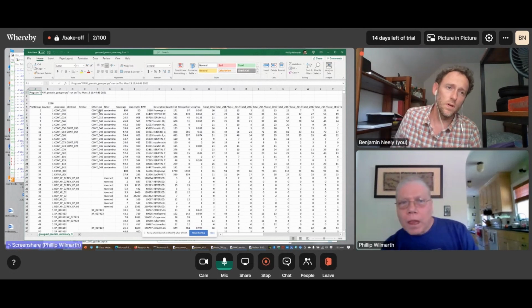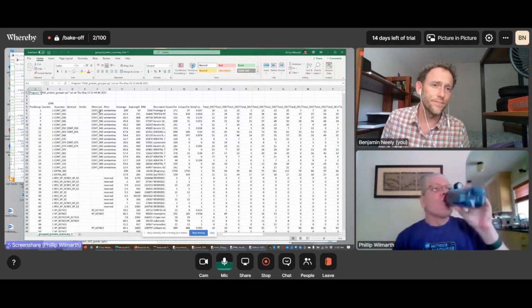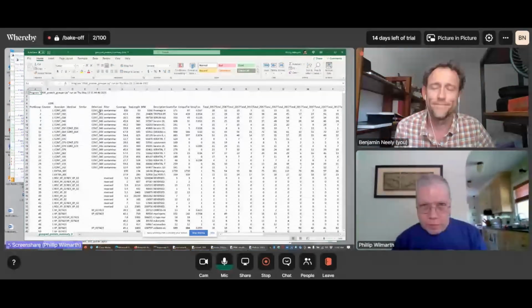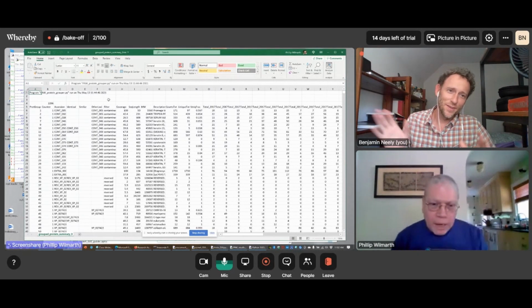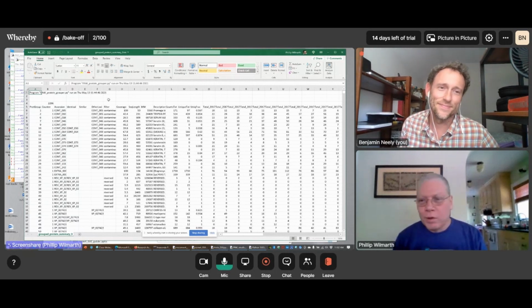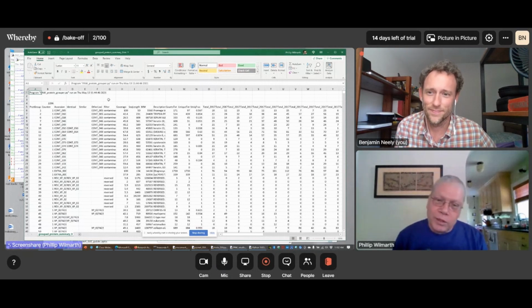Now, when you, sorry, yeah. Where is the contaminants database, is it just built in? That's part of the FASTA file preparation steps with the FASTA utilities that I've got. So we typically bring down these databases and then add decoy sequences and common contaminants. Got it. And that's how they're prepared for the target-decoy stuff. Back when this all started, there weren't decoy databases, and there wasn't consensus about how to make the decoy databases. And a lot of the search engines now have options to do the decoy stuff internally. And that's maybe safer than doing it externally.